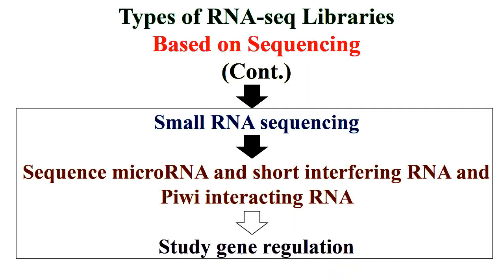Otherwise, small RNA sequencing sequences microRNA, short interfering RNA, and Piwi-interacting RNA, to study gene regulation, as mentioned in the next slide.